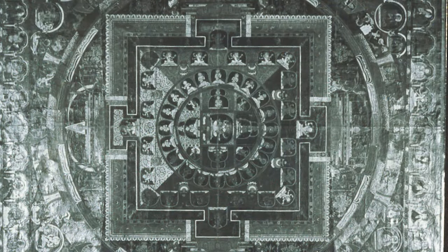Ultraviolet reflection photography. We must distinguish clearly between ultraviolet reflection photography and ultraviolet fluorescence photography. These are two very different but complementary techniques. Ultraviolet reflection photography brings out inscriptions, erasures, and barely visible components, but in a way that is quite different from infrared photography. The way the material is penetrated and the optical reaction of the pigments under UV rays are indeed not the same as under infrared rays.